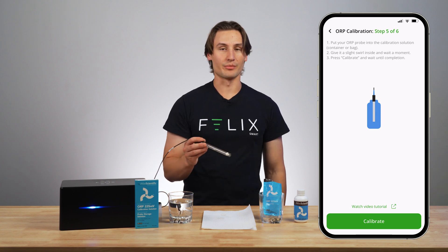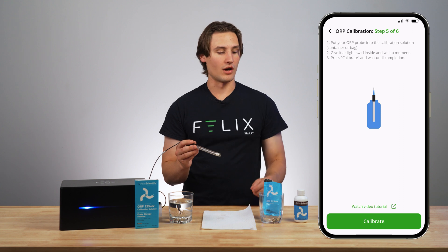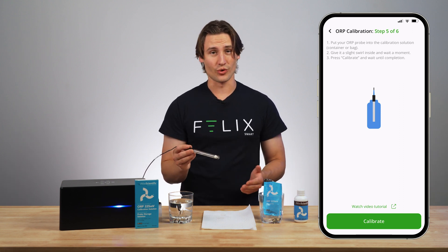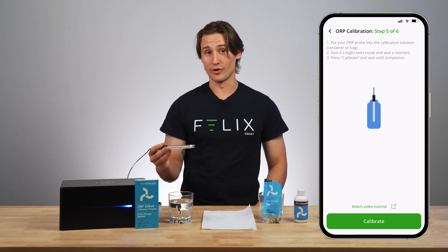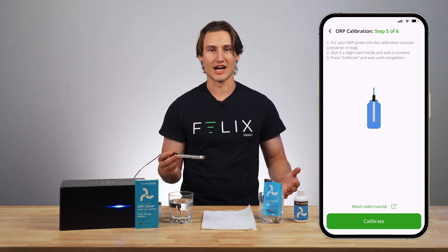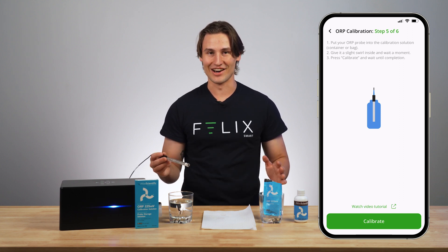Put your ORP probe into the calibration solution. Today I'm using a calibration bag, but also available are these calibration containers. You're also going to get a storage solution if your ORP probe needs to be out of liquid for a long period of time, because that will actually kill the probe. You don't want to leave your ORP probe out for extended periods of time — it won't be able to be regenerated. It's just done.